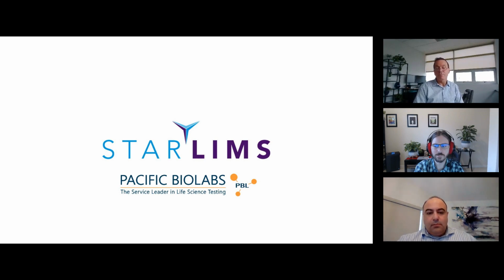And there also is going to be, by the way, probably some expectation of validation or verification of the use of this tool, which I assume STARLIMS has some internal documentation about, regarding their own testing of this tool and the reliability of it.